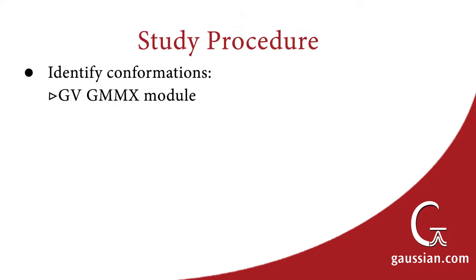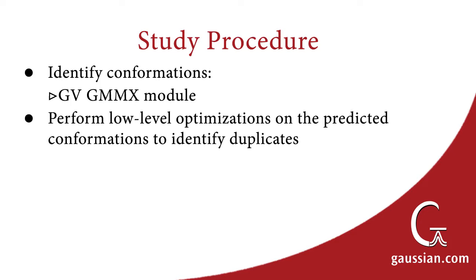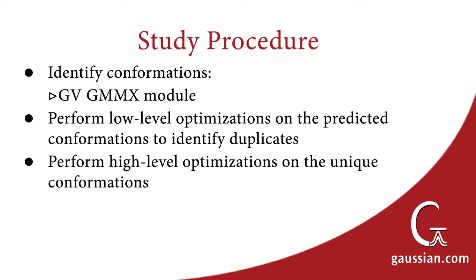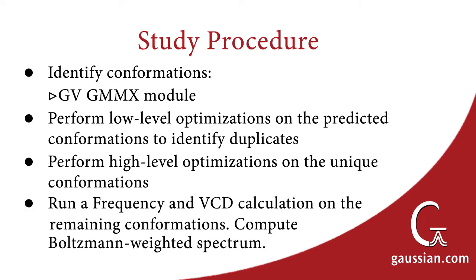Our study will consist of several phases. First, we will use GMMX to search for conformations of our molecule. Next, we will perform low-level ab initio optimizations for all of the located conformations. Third, we will perform high-level optimizations for the set of unique structures produced by the second step. Finally, we will run frequency calculations including VCD for each unique conformation. We will use the individual results to compute the conformationally averaged VCD spectrum in Gaussview.